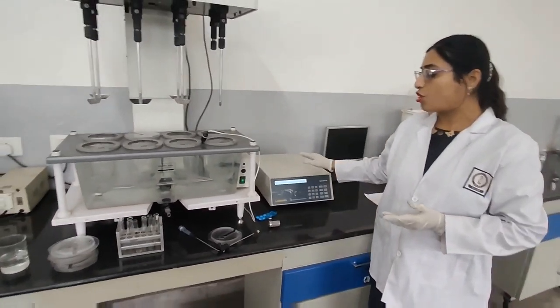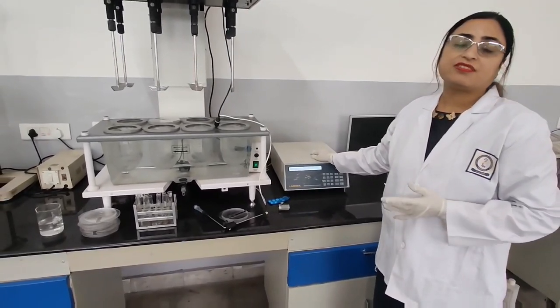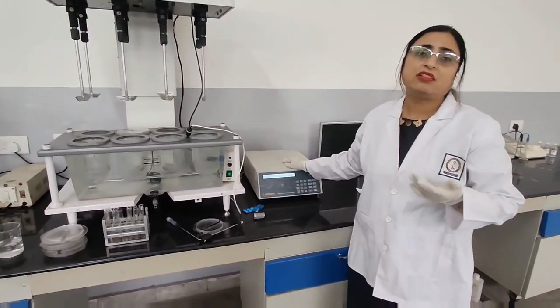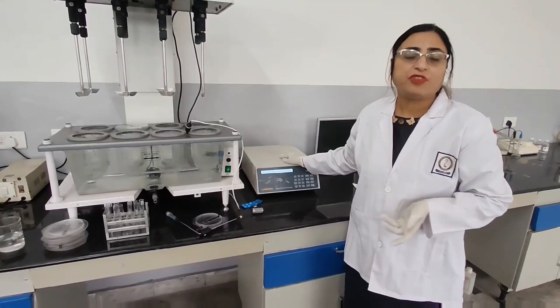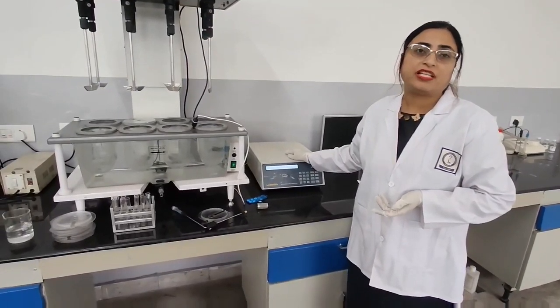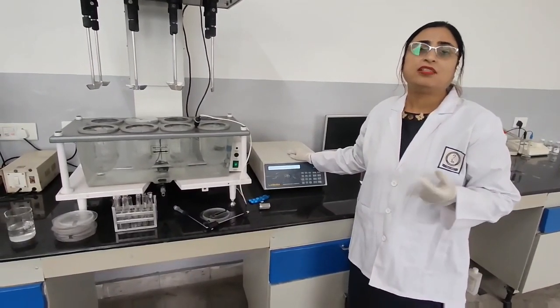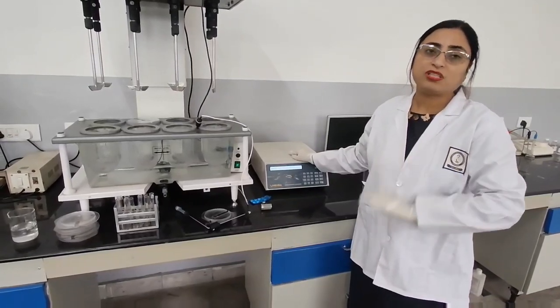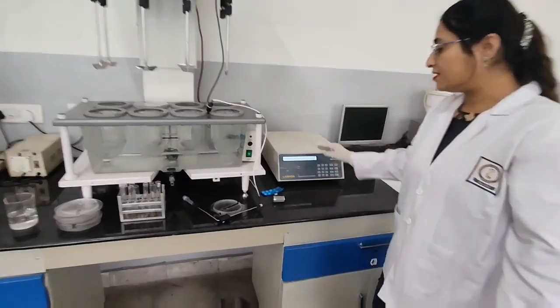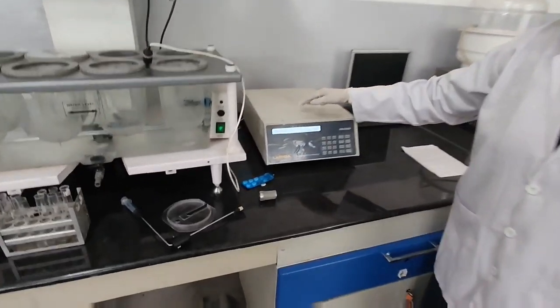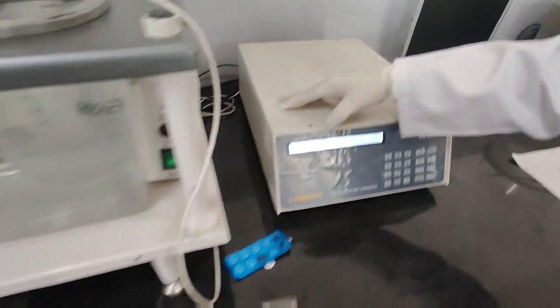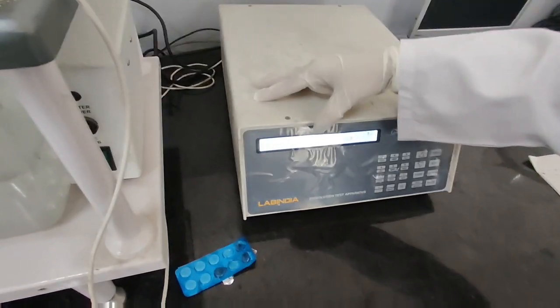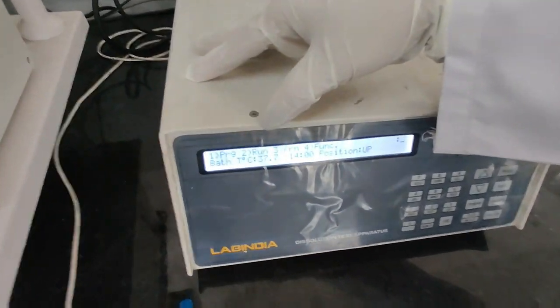After doing this, next part is this operating system. In this operating system, we will set the program: how much RPM we want, the number of samplings, the timing between samples. As we can see, there are four options: program, run, print, and function. First of all, we have to set the program. We will select one and then press enter.